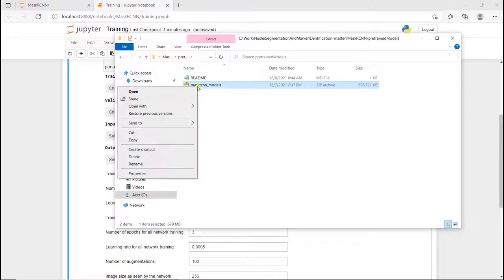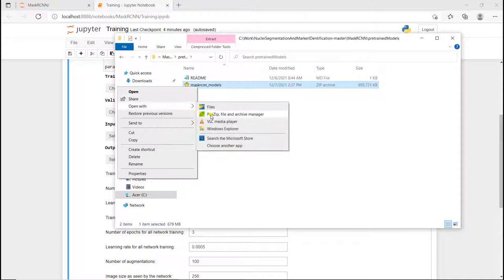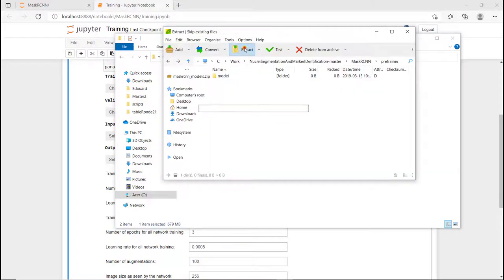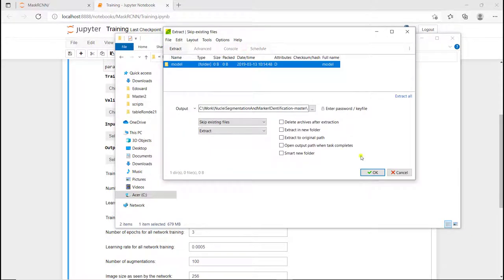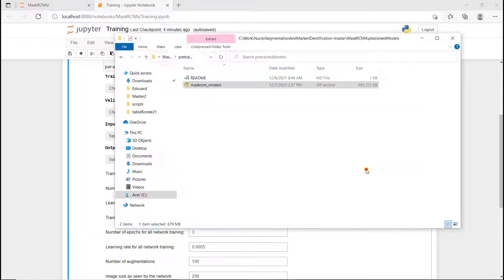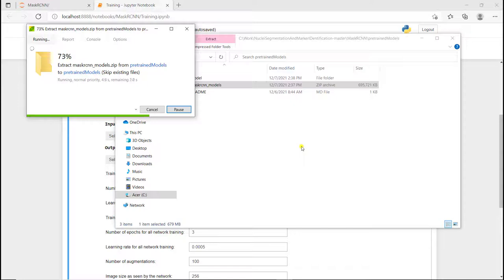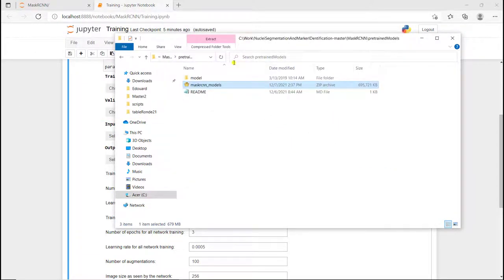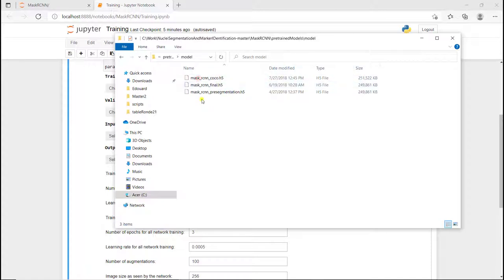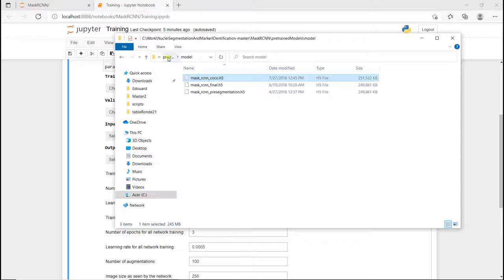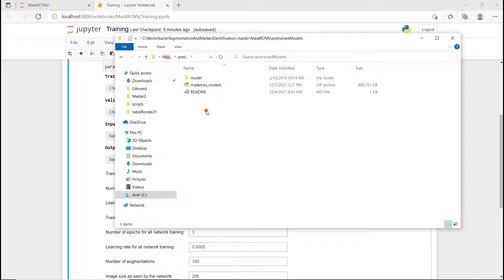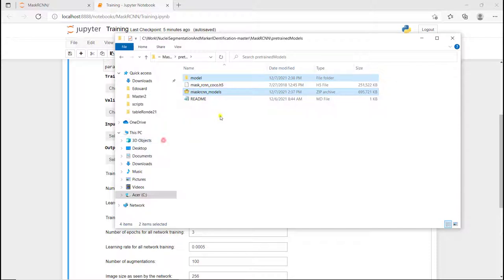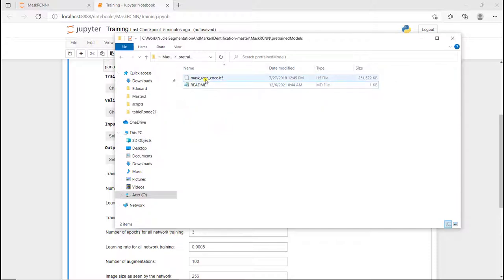It created a new folder model with the pre-trained model, and the only one I'm interested in is this one. So I'm going to cut it, paste it here, and remove those two because I don't need them anymore. And now I have the pre-trained model I want to use.